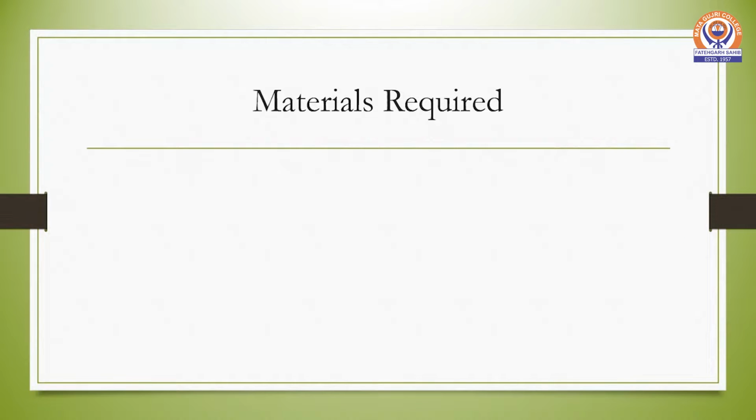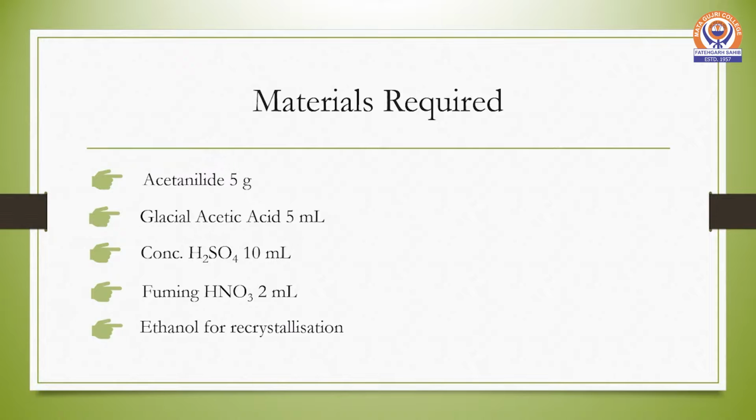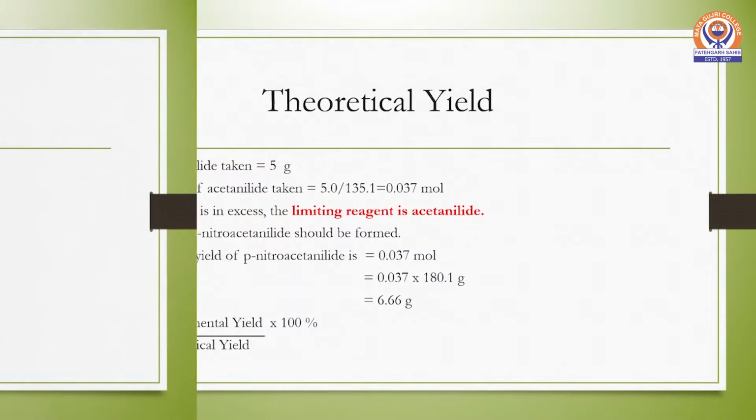The materials required for the synthesis are acetanilide 5 grams, glacial acetic acid 5 ml, concentrated H2SO4 10 ml, fuming HNO3 2 ml, and ethanol for the recrystallization purposes.